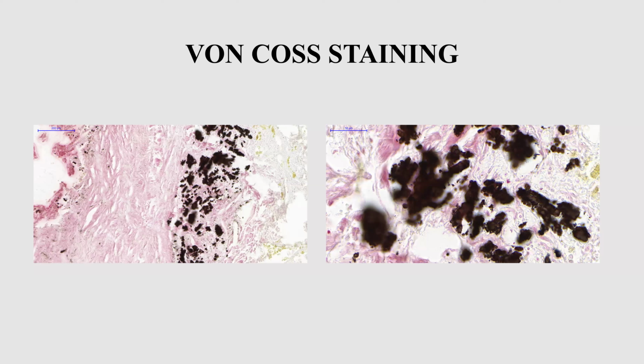But this hydroxyapatite has different levels of maturity. I also read in books, as nobody taught me. I used books to reconstruct this staining because it's not easy, and the chemical for this pink color is very rare.